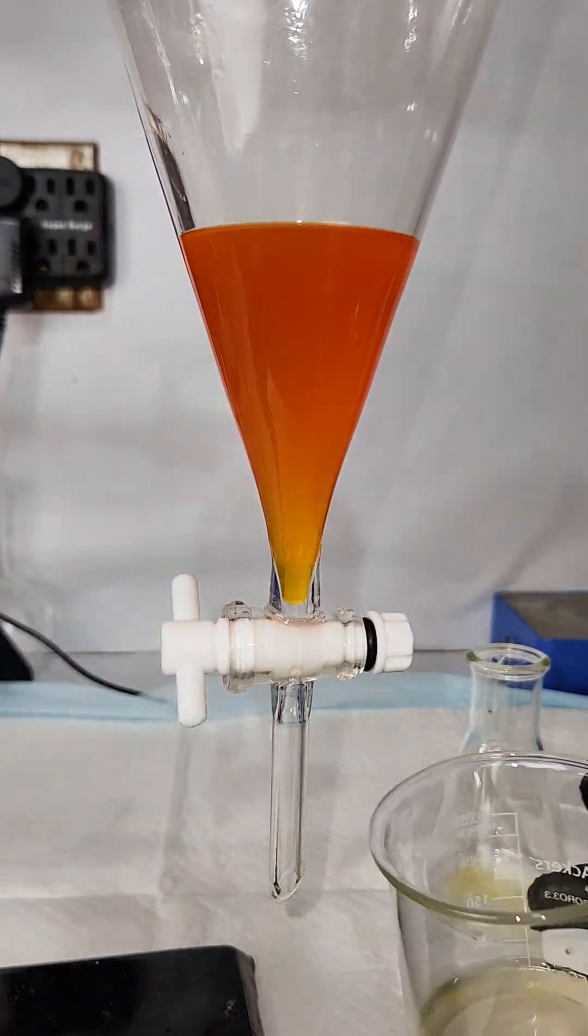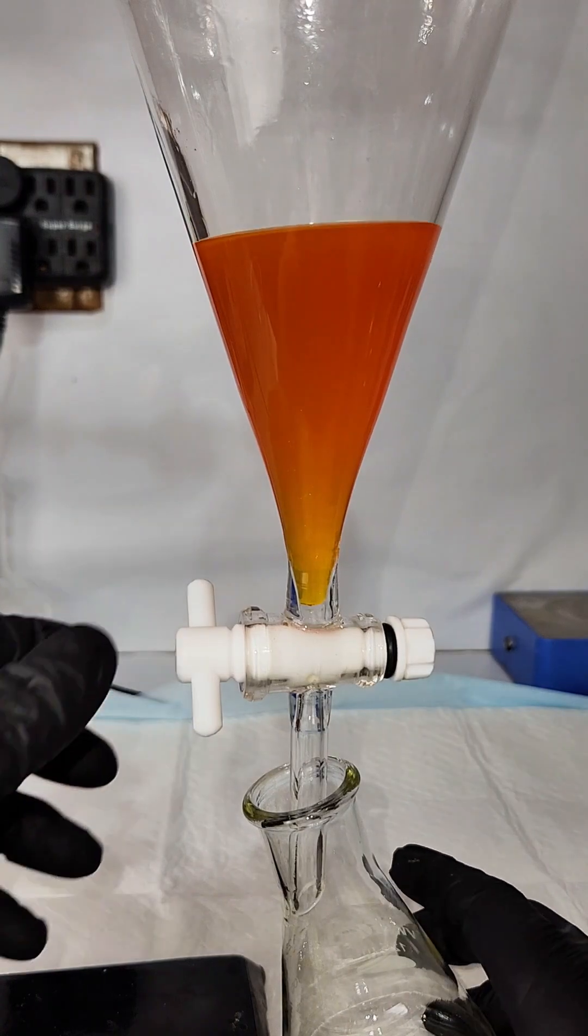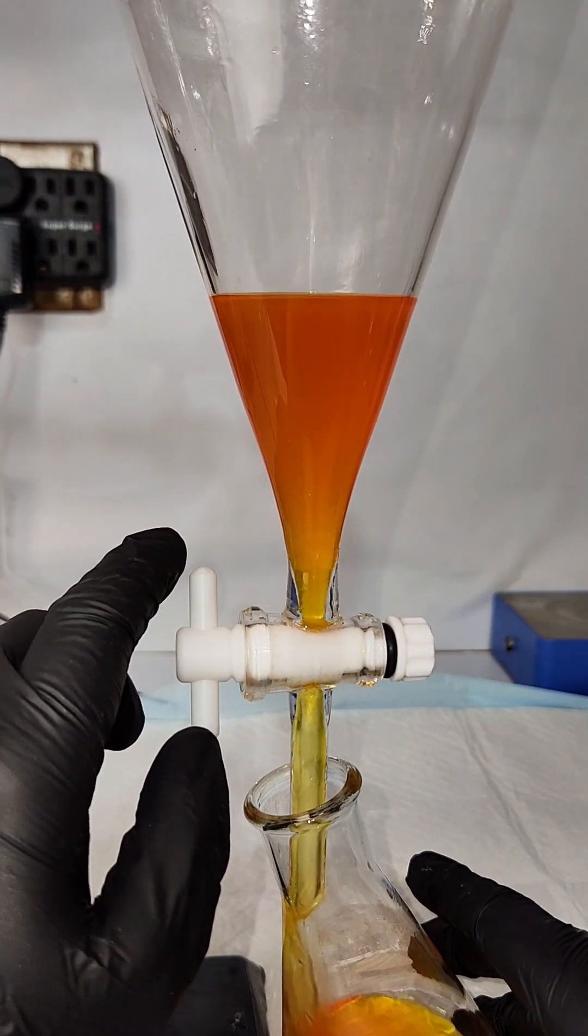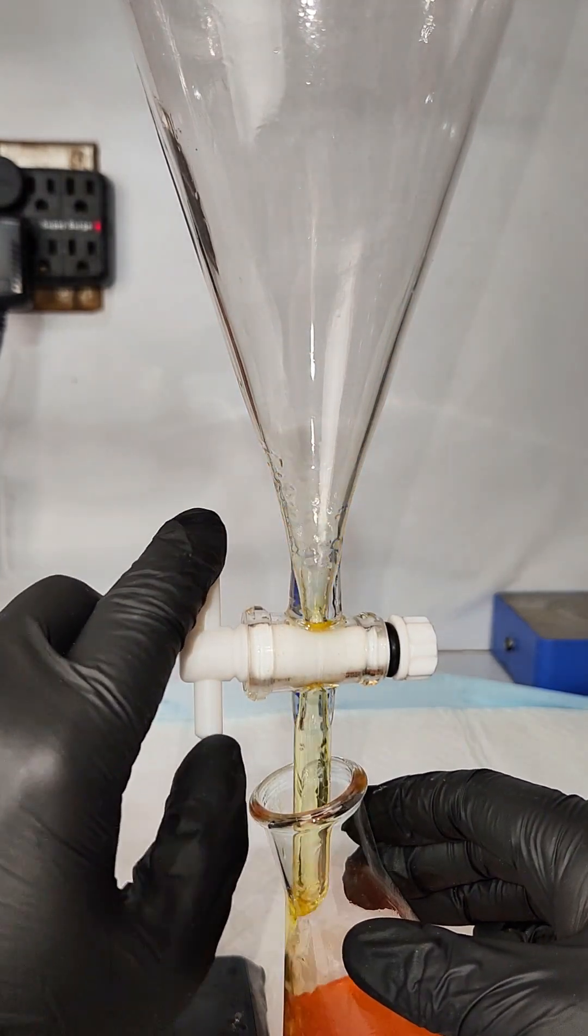My next step is to dry off any remaining moisture. This is done by the simple addition of any number of hydroscopic inorganic compounds. Most commonly, this would be calcium chloride, magnesium sulfate, or sodium sulfate, and I opted for calcium chloride.